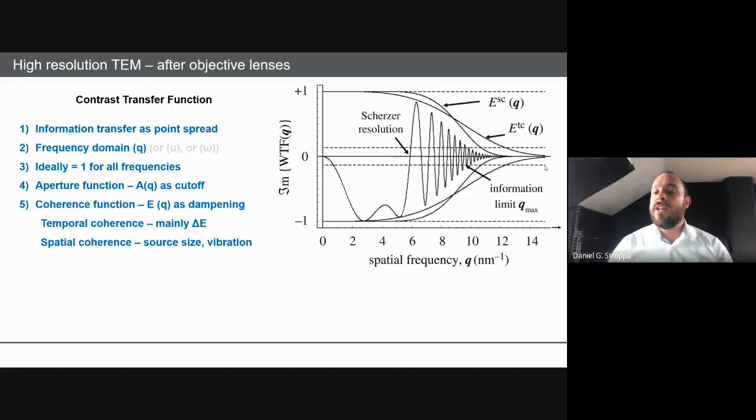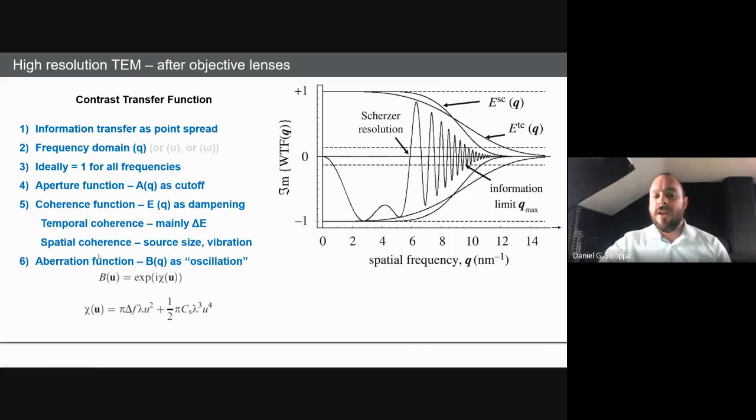So basically the lens is not perfect. It's going to have defocus and astigmatism effects that, if you expand this into a series, give you an overview of the aberration. This transfer function is what you apply to the electron wave that comes out of the sample.